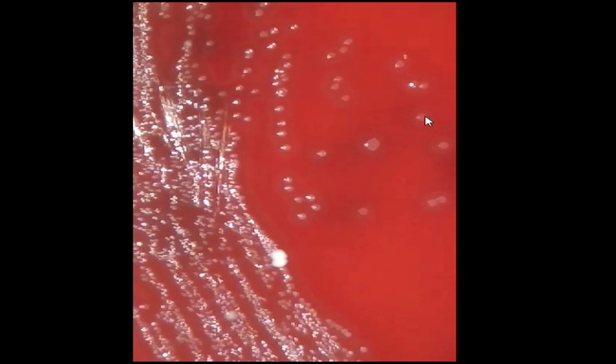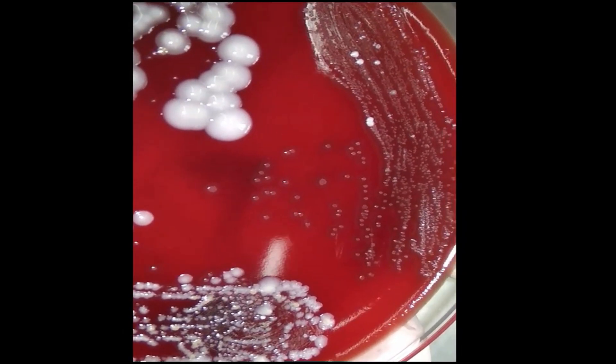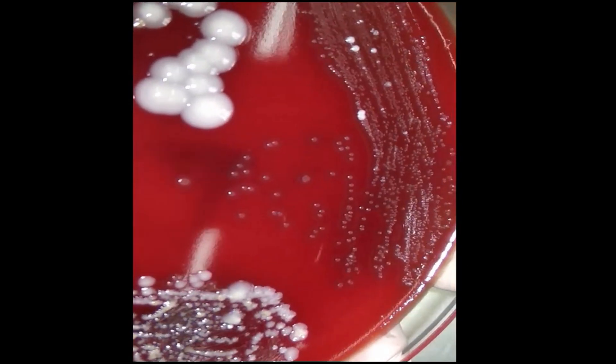This one, this one, this one, this one — try to observe each of these colonies.